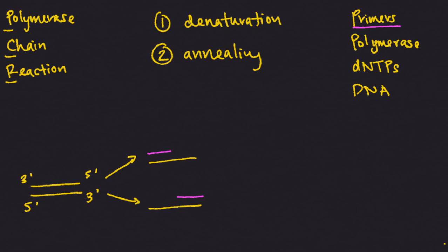And what I mean by design is create the exact complementary strands to the DNA sequence that sit right outside the DNA sequence they wish to amplify. And so right here in the circled region, say if that's the DNA strand I want to amplify, then I want to make my primer, which is right here, sit right outside that region.